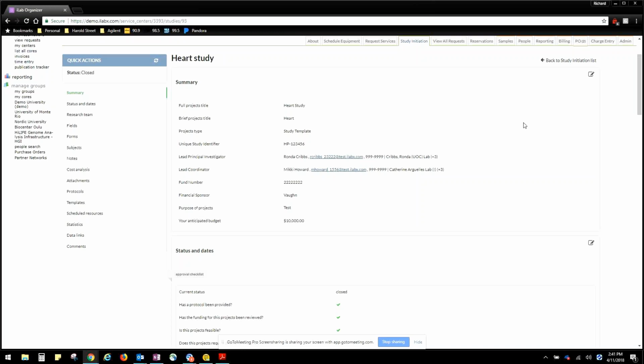She'll have that ability to technically speak to some of those here. But just know that, like many parts of iLab, a lot of this can be turned on and off depending on what you're looking to do and the data that you're looking to collect.